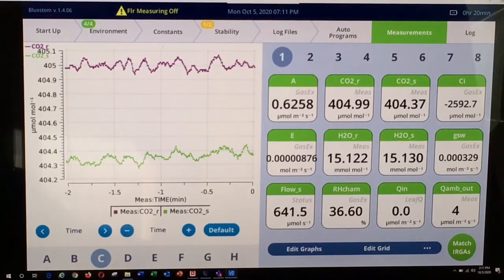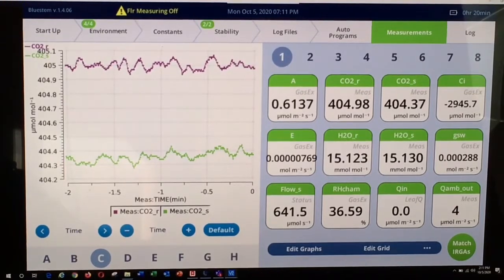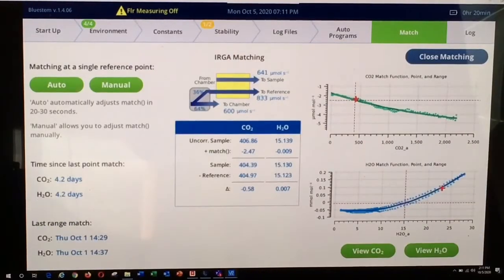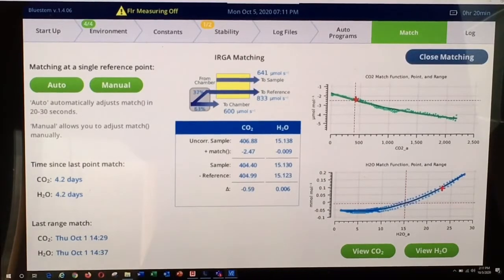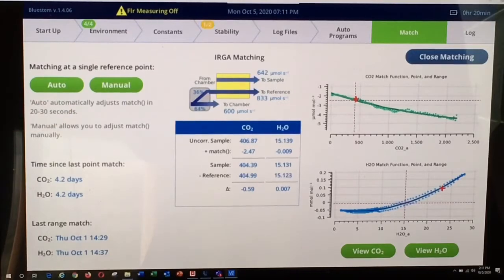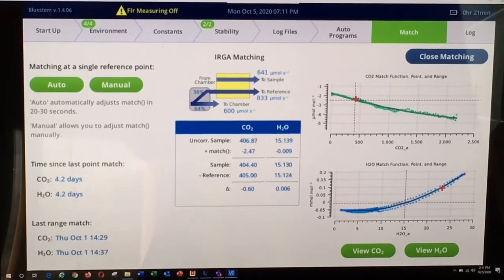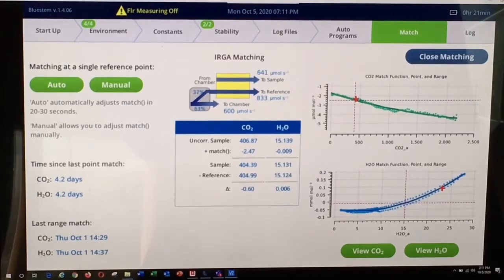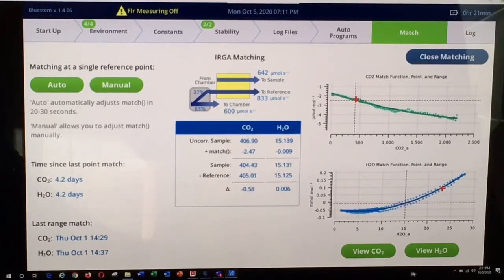That functionality can be found by accessing the Match IRGAs function at the bottom of the screen. At the top left of the screen, we have the traditional single point matching — auto and manual. Most of the time, if you are using traditional single point matching, you'll select the automatic function and the instrument does all of the background calculations for you. The range match functionality is located in the lower right portion of the screen under the View CO2 and View H2O buttons. We will access the range match functionality for CO2.